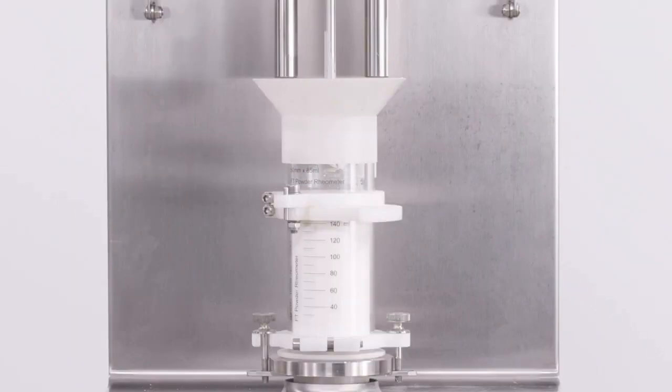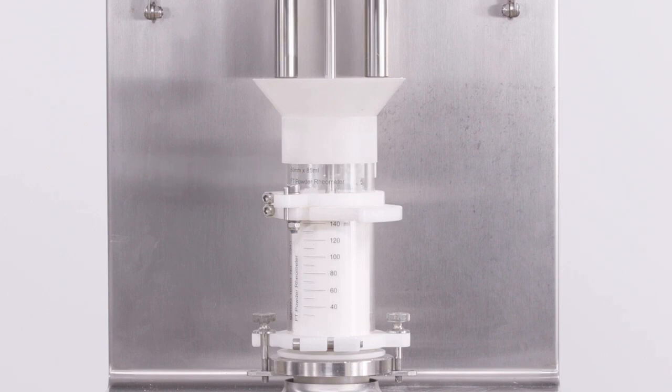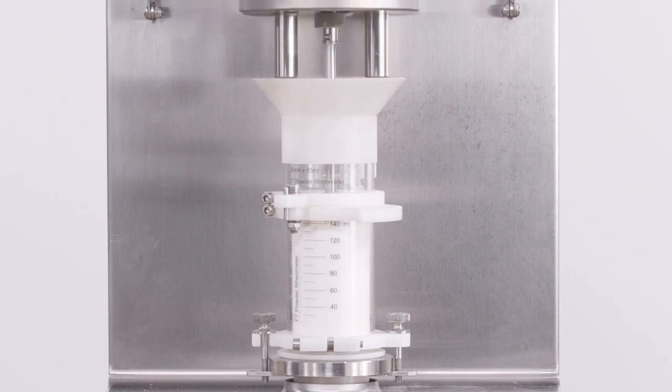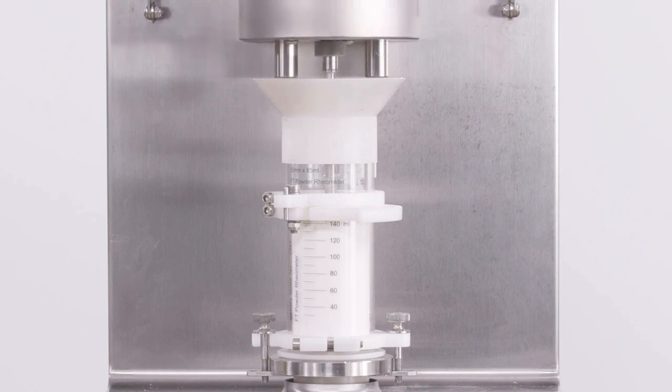During this section of the test, we are doing the same thing as in the stability section, running repeat cycles of conditioning and testing. Only now we are adjusting the tip speed of the blade to understand how the powder's flowability will change at different flow rates.